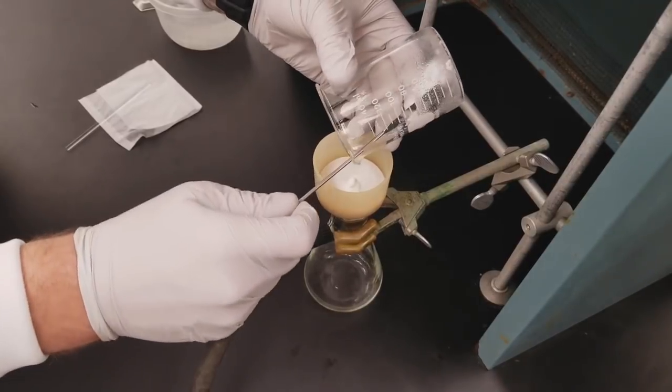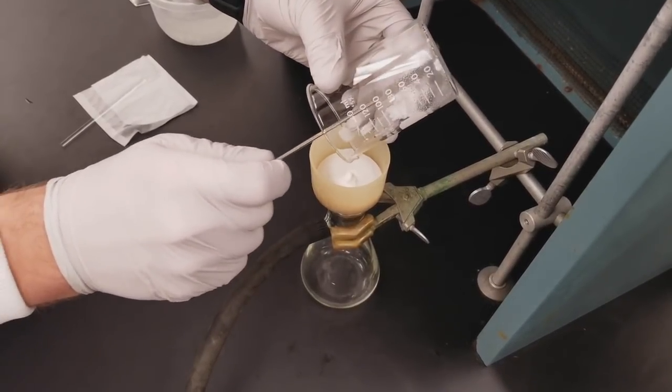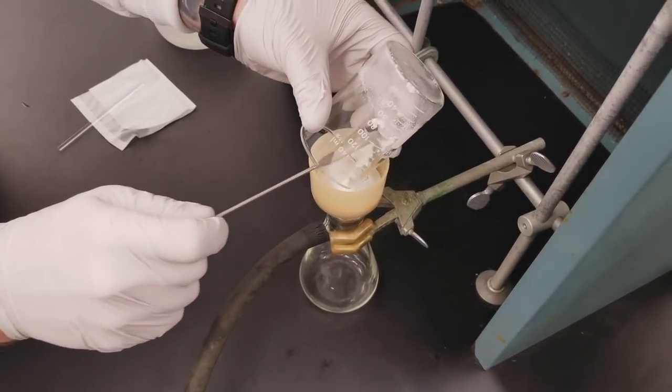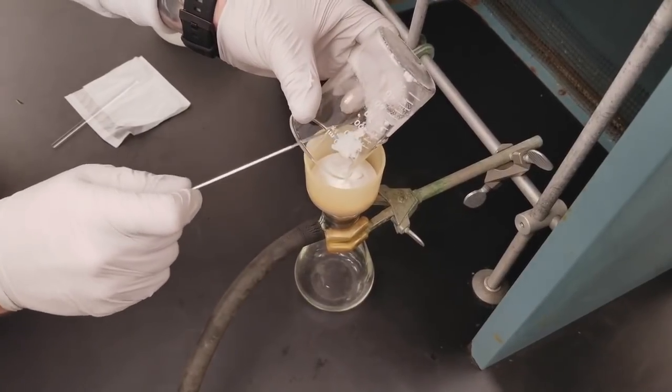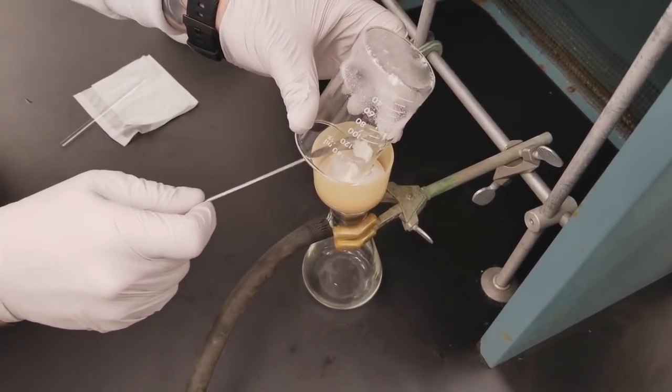You can use a spatula to help aid in transferring the solid over. Just again put that into the center of the Buchner funnel.